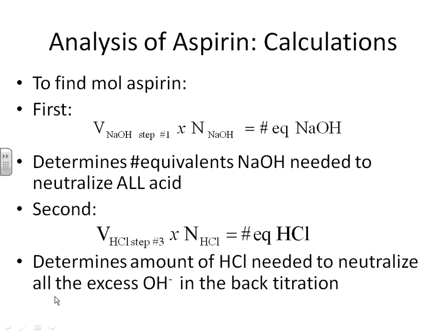So, analysis of aspirin, the calculations. First of all, we are going to be using the sodium hydroxide that you standardized before, because we're going to pull in normality again. We're going to pull in the idea of equivalence.